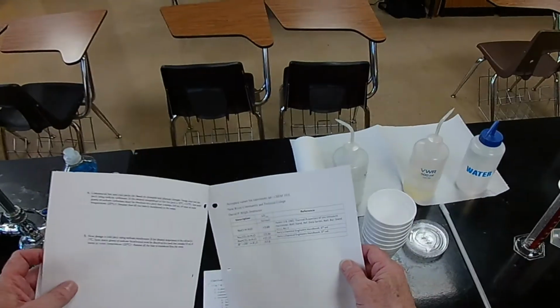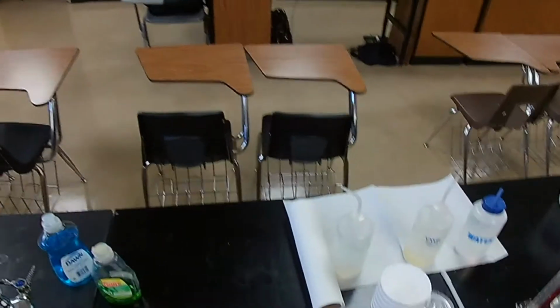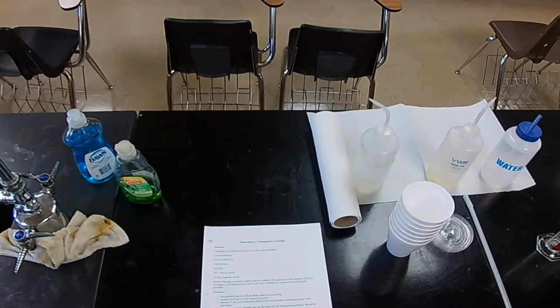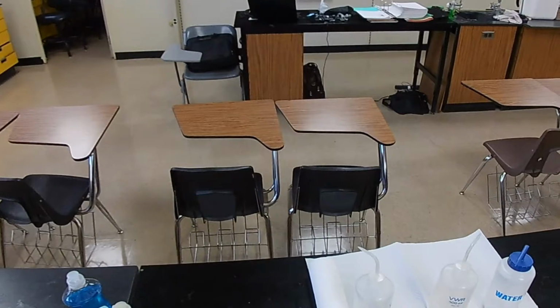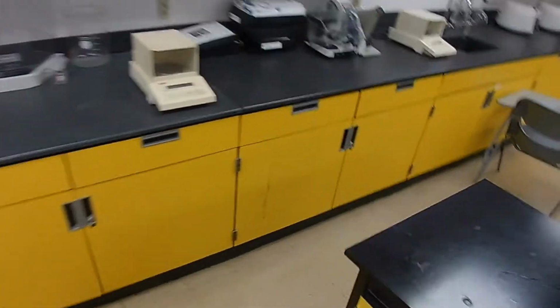Of course, you'll want to read it and set it up in your lab notebook so that you have all the information you need to write the report in your notebook, and you'll create tables in your notebook so that you'll have a place for information to go. And your tables will be very simple.